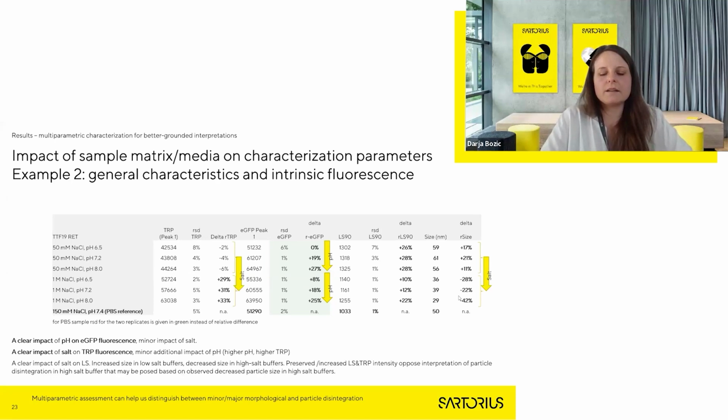So the methodology allows multi-labeling. What might be a limitation is the number of available binding sites. If you are talking about immunolabeling, the same issues appear as with other methods such as flow cytometry.